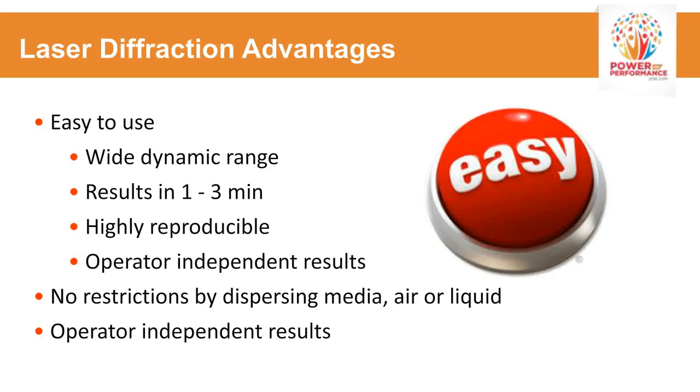Now, the advantages of laser diffraction are multifold. These instruments are quite easy to use. They cover a broad dynamic range, in other words, from submicron particles to usually multiple millimeters, so a couple of thousand microns down to below a micron. They can do this quite fast. Typically, results can be in 1 to 3 minutes, thereabouts, could be a little longer depending on if running liquid systems.